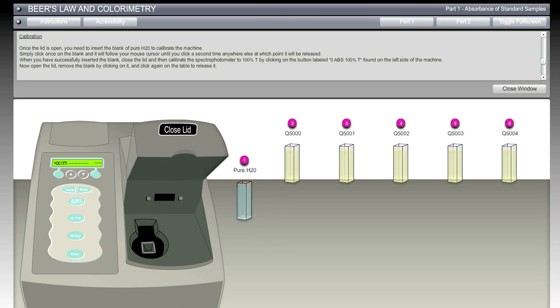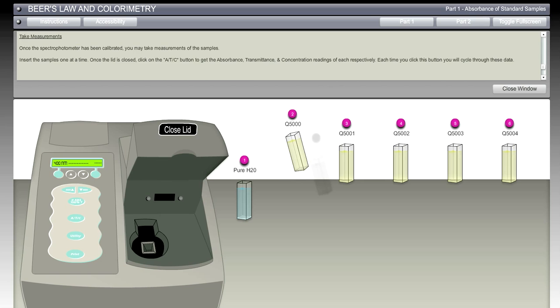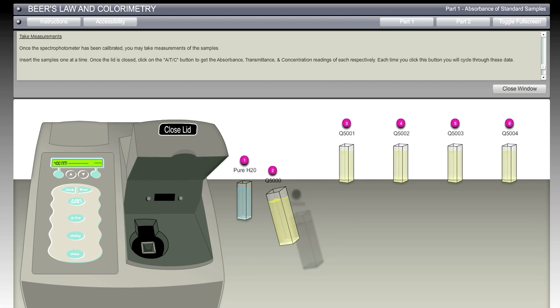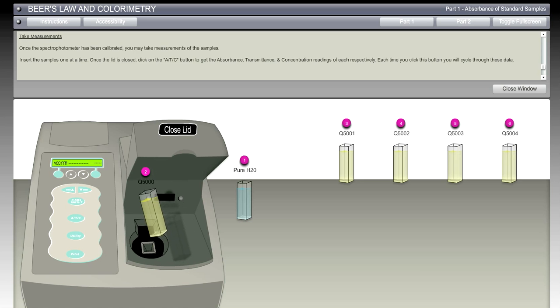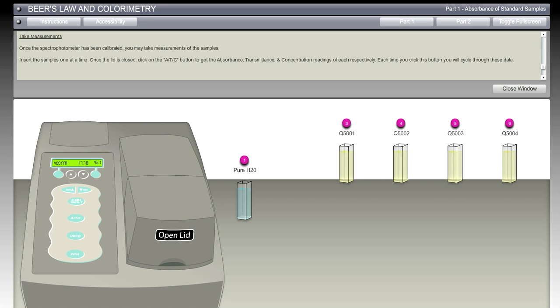Now we're off to the next set of instructions. Take measurements. So now we've got the part where once we have the spectrophotometer calibrated, we're going to take the measurements of the samples. We're going to grab this first one, Q5000, and drop that in the same receptacle that we did earlier with the water. Now that it's in there, we're going to close the lid.